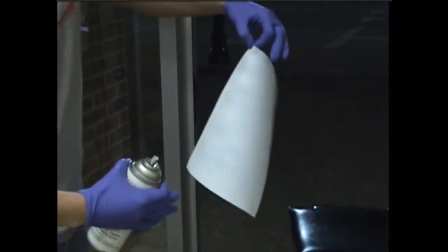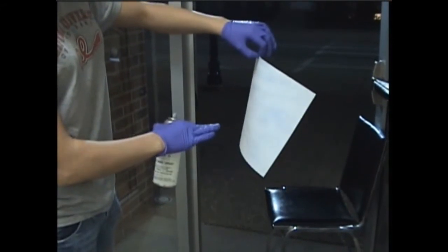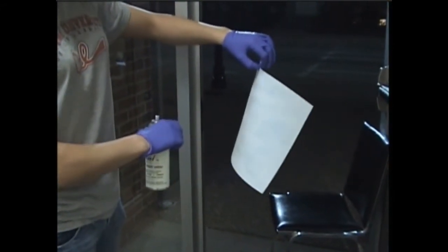Now, ninhydrin takes about 24 hours for the print to show up on a piece of paper.